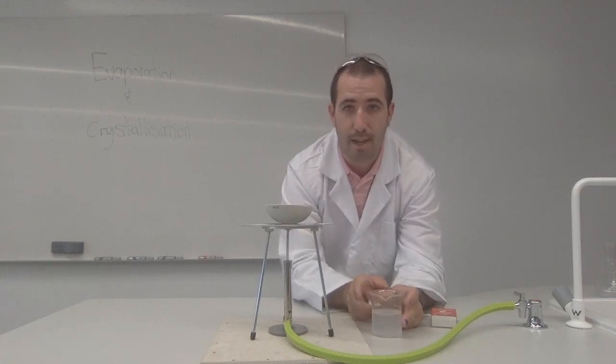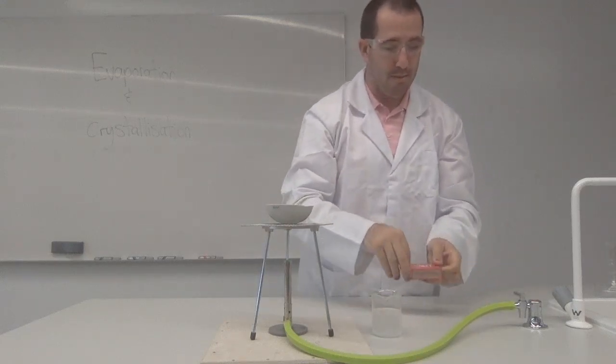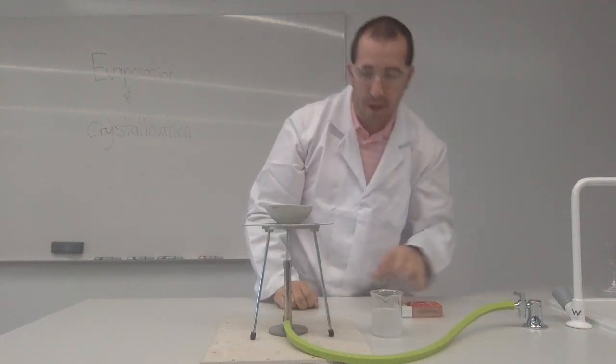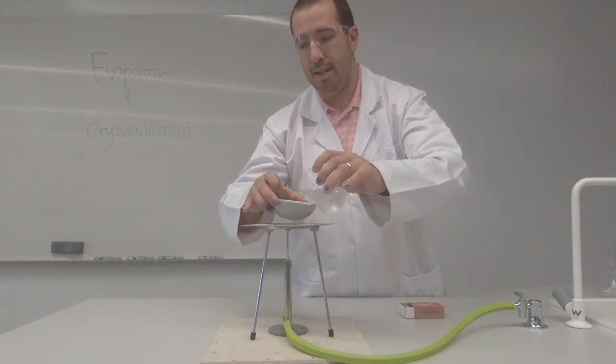So once again, let's think about safety: glasses, matches. Remember, gas tap off first. Let's close our hole. There we go, ready to go. So what we're going to do now is just pour some of this in.